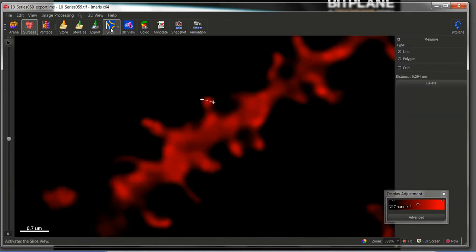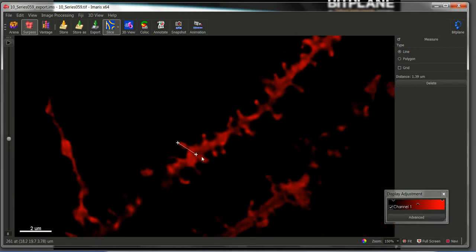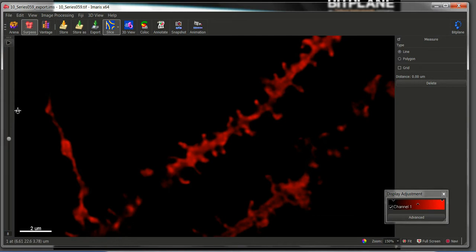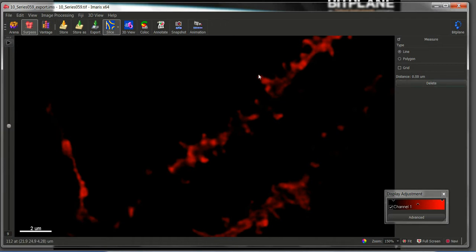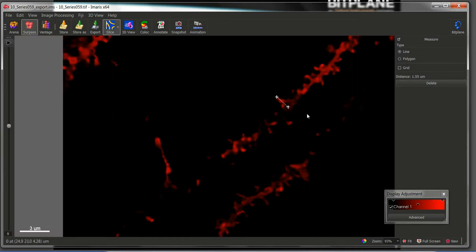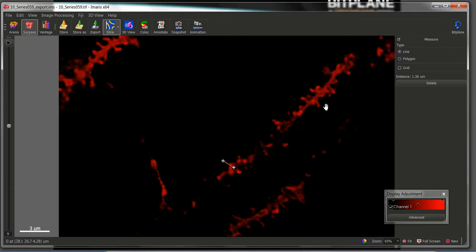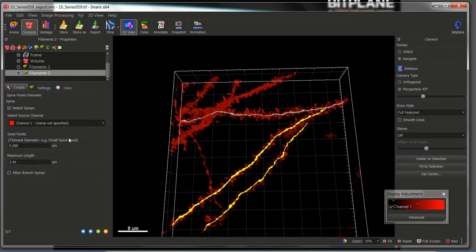And now we have to enter the maximum length of a spine. Again, click in slice and we can measure the length of some of the spines from the middle of the trunk of the dendrite to the end of the spine. We can measure different ones to have an idea of how long the spines can be. In this case they are around 2 microns or 1.5 microns. So let's choose the longest distance, in this case 2 microns. So I will enter a maximum length of 2 microns.